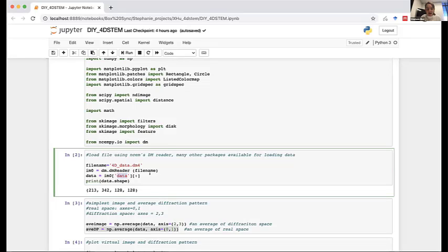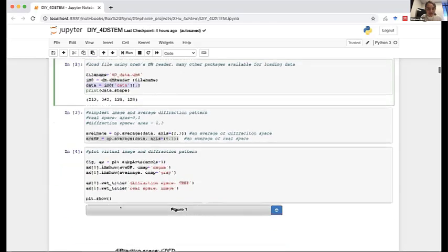And so this is the line where I selected that I just wanted the data, but like you just said, Roberto, we could grab any part of the metadata. And that will be useful for plotting your calibration, having the calibration and other information that you may need to plot, like the scale bar, etc. Yeah, exactly.